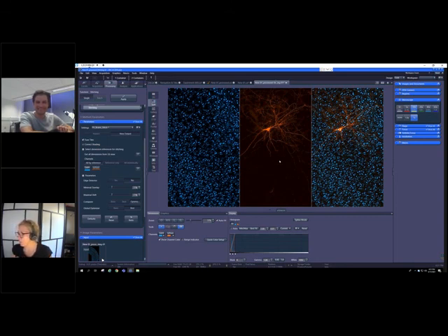We're going to wrap up here soon. There was maybe one or two questions actually about whether you can combine AI sample finder with live cell incubation. So maybe you can just give a quick answer to that question.